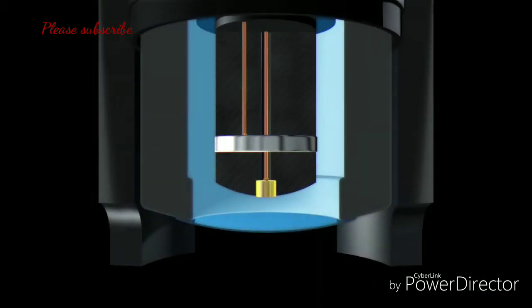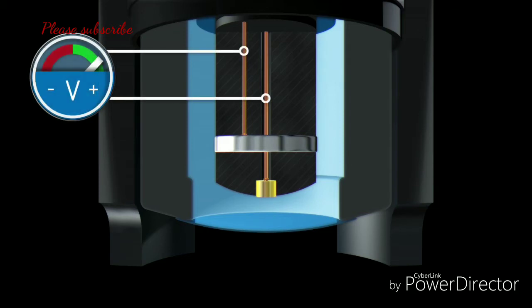An amperometric sensor usually consists of a gold cathode, also called working electrode, and a silver anode, the counter electrode. A DC voltage is applied to both electrodes. The cathode and anode are located in a reaction chamber that is filled with an electrolyte. The reaction chamber is separated from the medium by a membrane. This porous membrane allows dissolved oxygen to diffuse into the sensor.